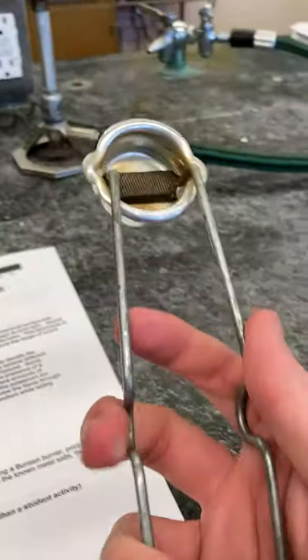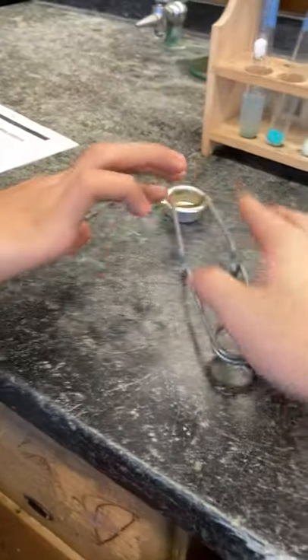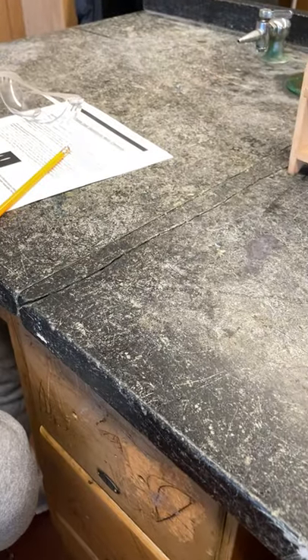If you're struggling on getting the Bunsen burner lit, just call me over. Most likely, you just have to adjust the air mixture or something like that. Go ahead and do it. Alright, so let's take a look at our information here.